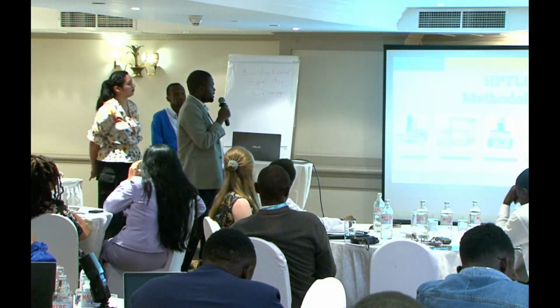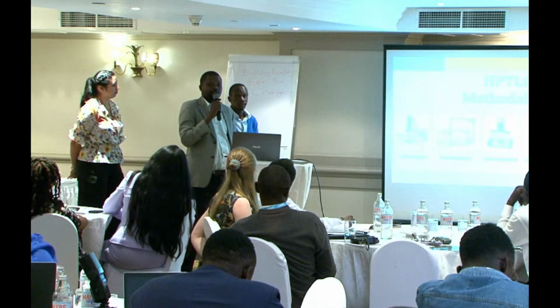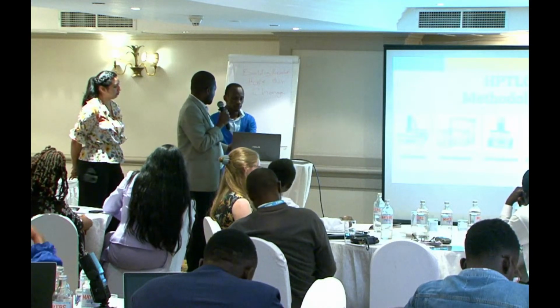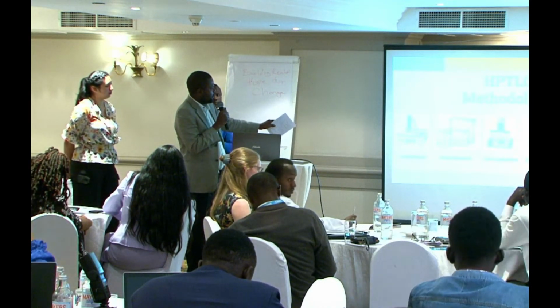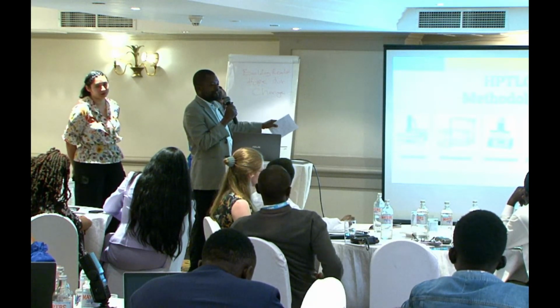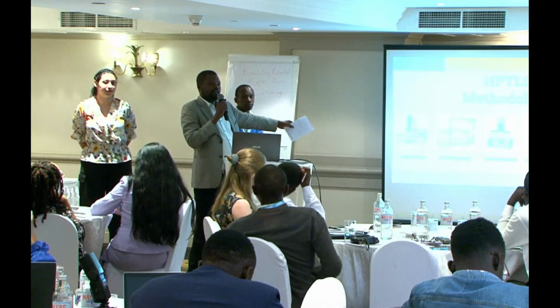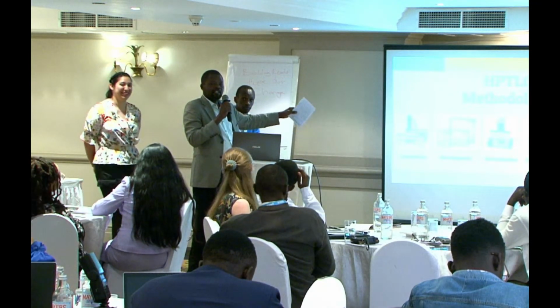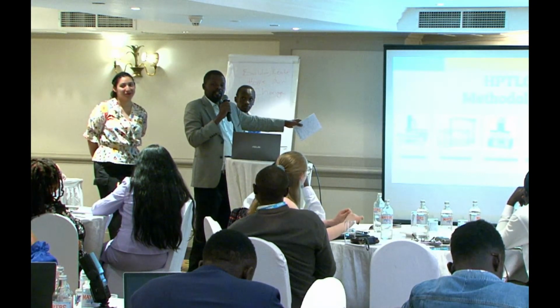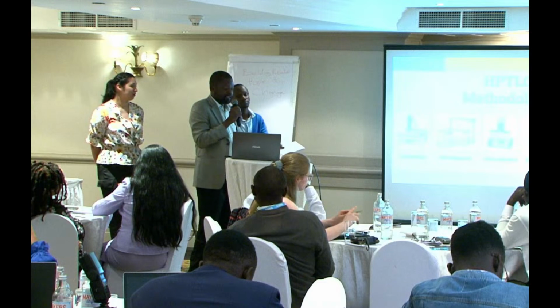Thank you so much. I think everybody has been talking about the methodology. Of course, those are the steps involved. I would just like to comment that when we started doing the work, we had issues with developing the TLC. The HPTLC was having some extra lines because of the reagents, the solvents. The toluene and ethyl acetate gave us a lot of problems. We had 4 or 5 HPTLC runs before we could have one nicely developed.